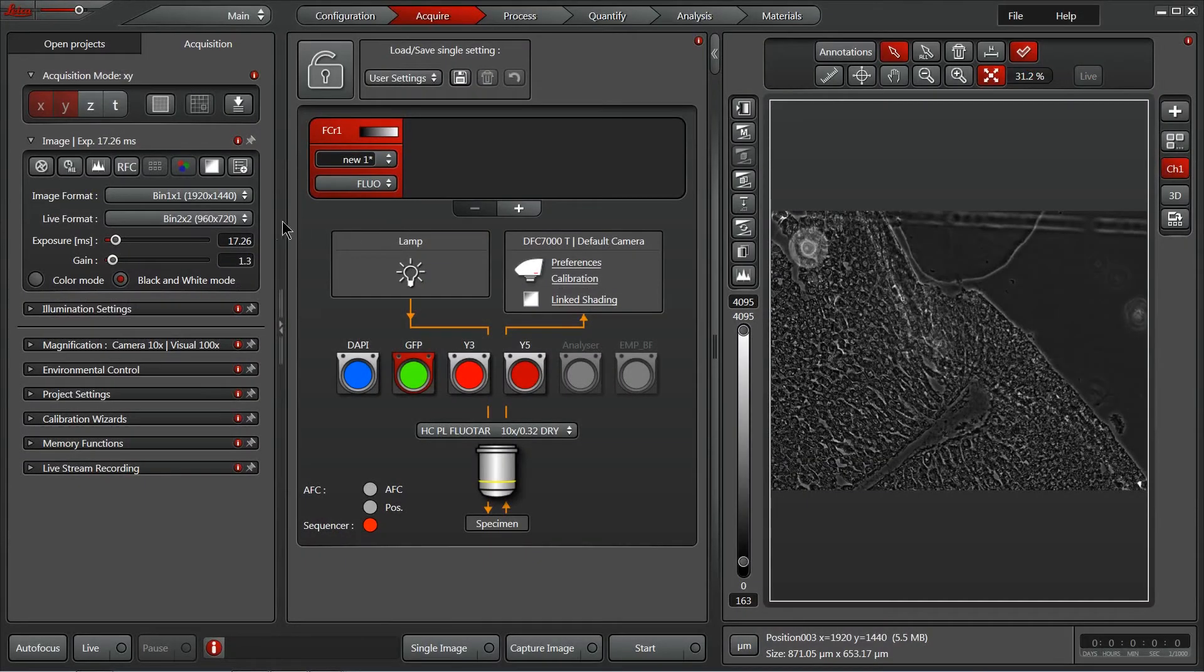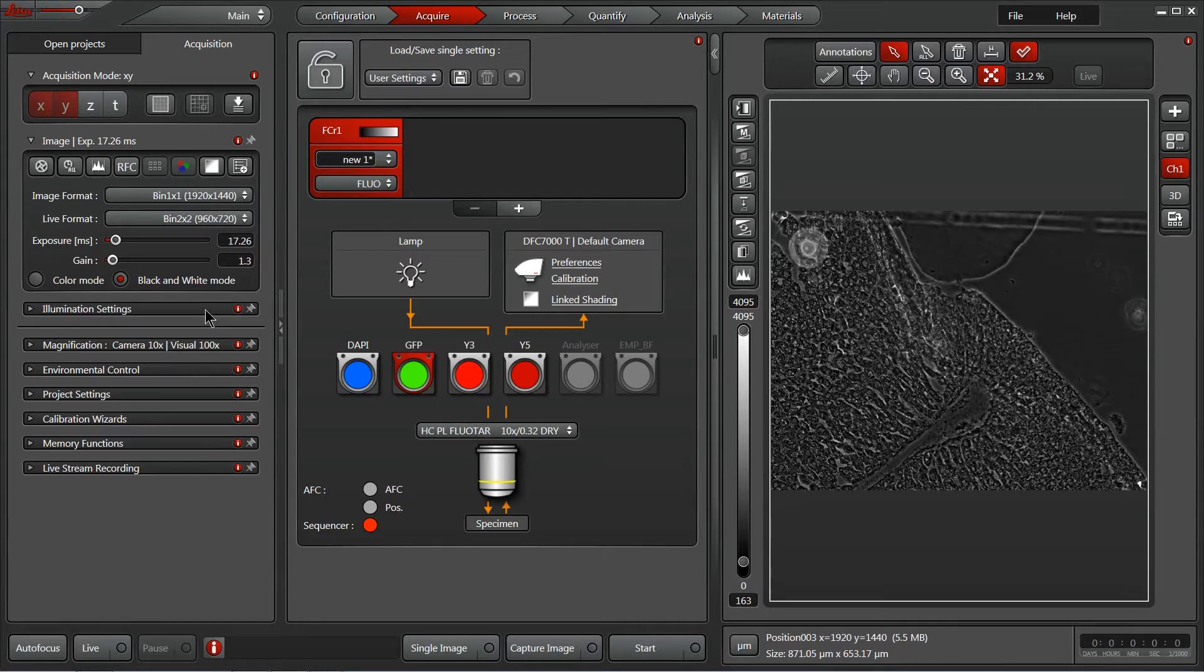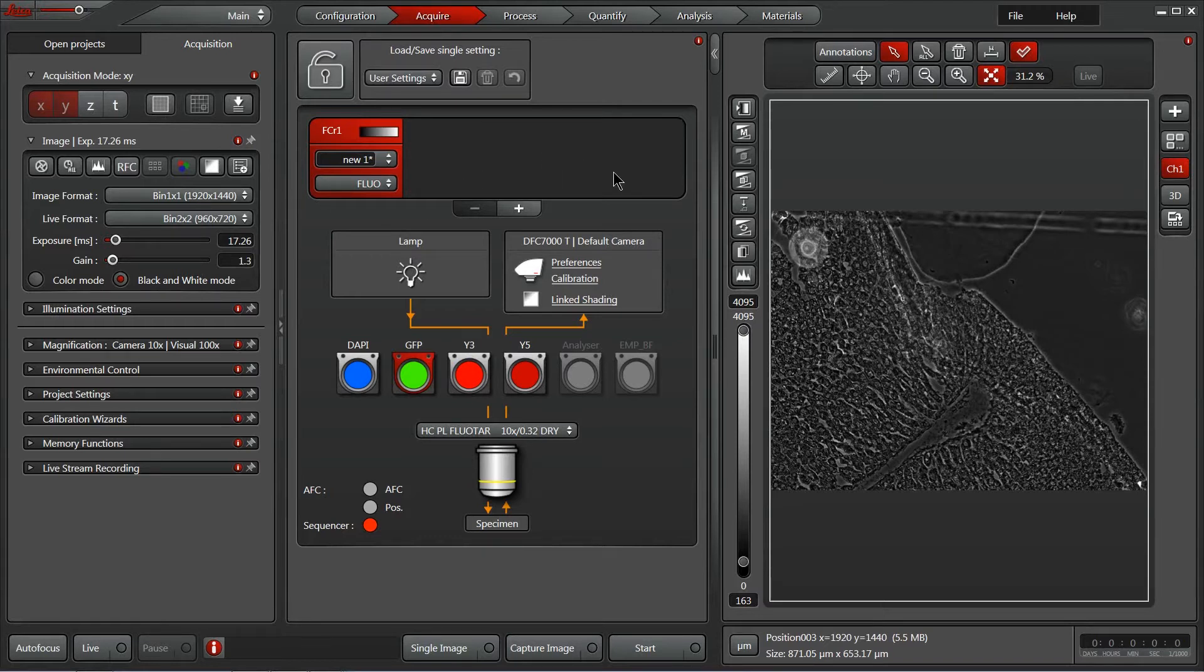Now before we go on to setting up the camera exposure times and illumination settings and our entire experiment, the first thing I'd like to do is set up the four fluorescence channels that I'm going to utilize for this training.